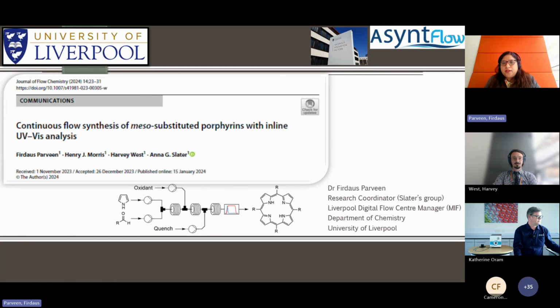Thank you, Andrew and Asynt, for your kind introduction and giving us the opportunity to present on this platform. So today I will talk about our recently published research on continuous flow synthesis of meso-substituted porphyrins with inline UV-vis analysis.